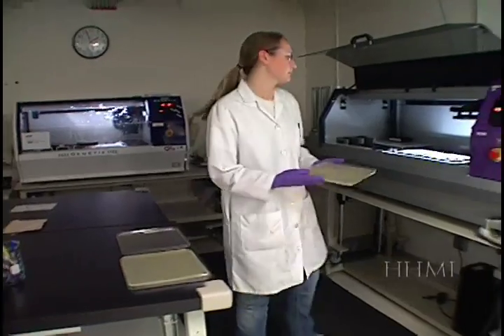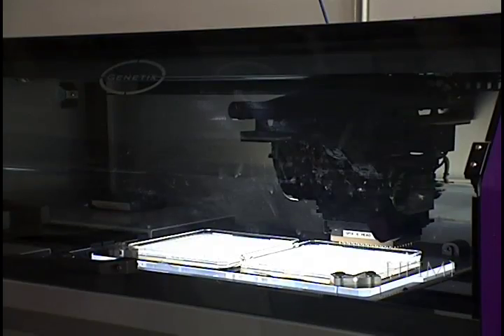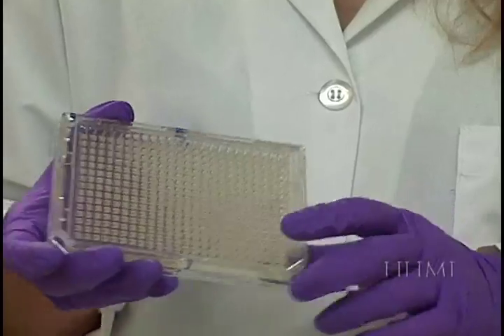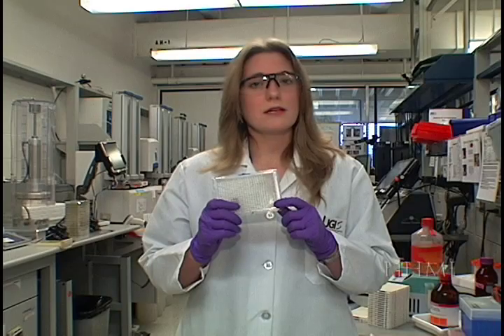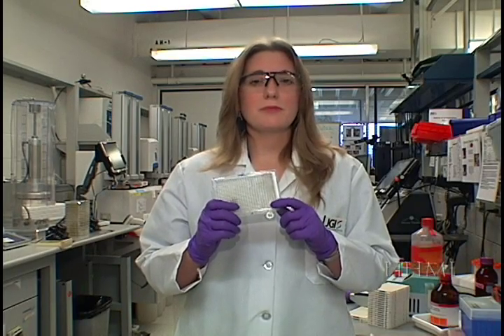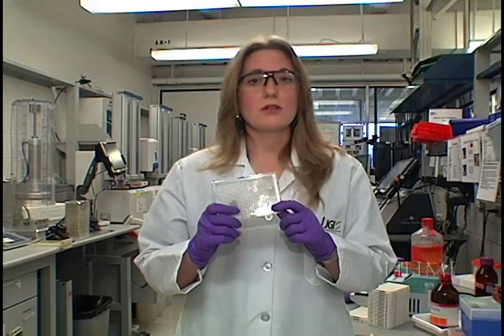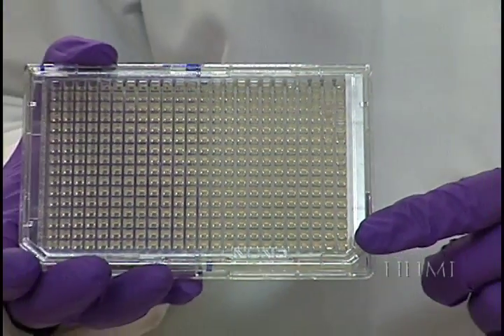We let the bacterial colonies of E. coli grow and transferred the colonies containing the cloned fragments of genomic DNA into these 384 well plates. A single well on these plates contains a colony of E. coli bacteria. Each bacteria contains a plasmid with our DNA insert that we want to sequence. Each well contains a different genomic DNA clone.